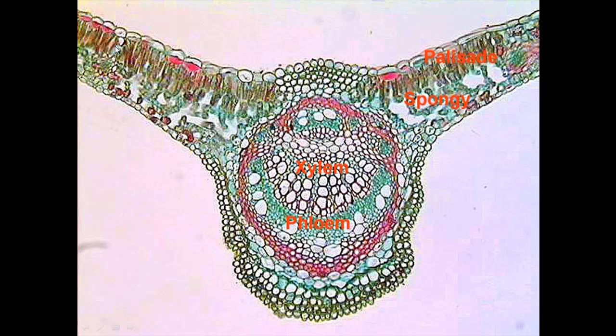They assume or they draw the palisade mesophyll continuing all the way across the top. Look at the top here in the middle. It's not the same as the palisade mesophyll either side. So this is a little bit of my collenchyma, and that's there, like I said, to provide structural support. Spongy mesophyll just underneath, we can see that either side. Again, that doesn't carry on all the way across. We've got that central vein kind of blocking the way there.